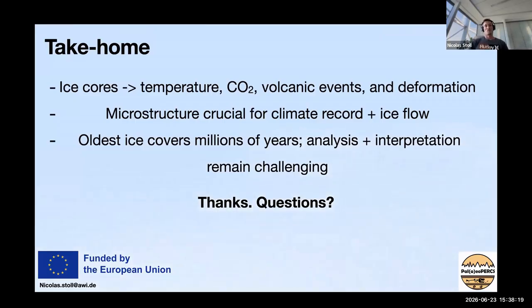So I didn't touch on one method, which is continuous flow analysis. So you just have your ice core and you melt it from the bottom and you just analyze the middle part of it. So it's quite safe regarding contamination. With this method, you can fast analyze a lot of ice, but you're limited to the centimeter resolution because the melting water mixes and all kinds of processes are happening. But this is the established method, but it's limited to one centimeter resolution. And therefore, yeah, we try to get below this, but this requires more time and resources and other things. So yeah, a lot of method development also at the moment.